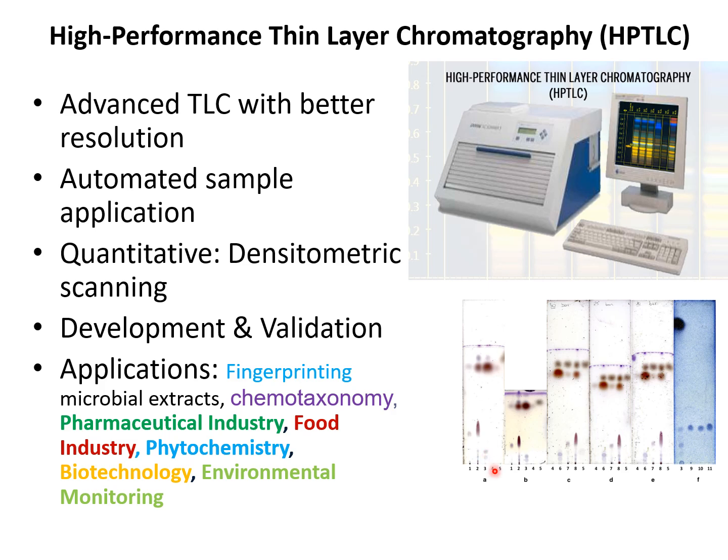Now, this fingerprinting is very useful in chemotaxonomy. It is used as a valuable tool in chemotaxonomy to classify microorganisms based on their chemical composition. In addition, it can also be used like the ordinary thin-layer chromatography in all the other applications such as in pharmaceutical industry for quality control of drugs, identification of impurities, stability testing, and so on.